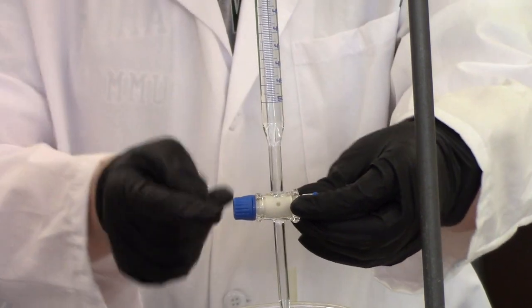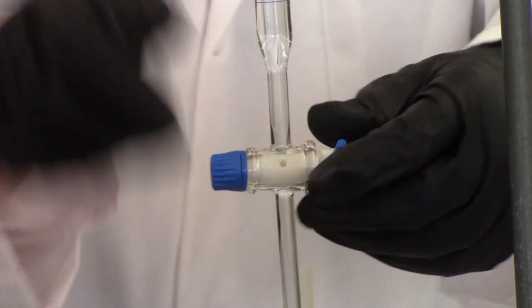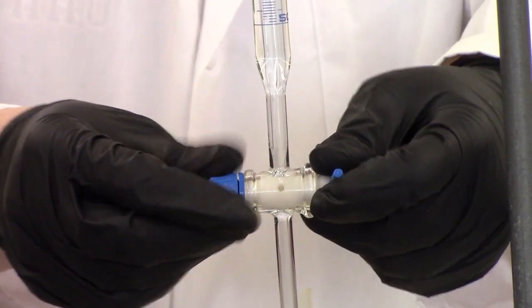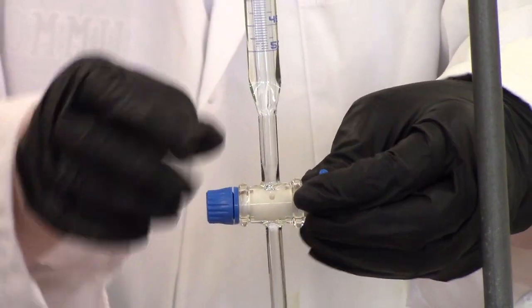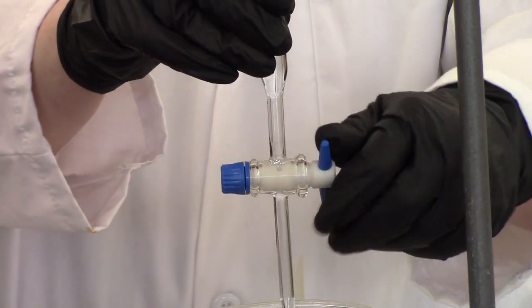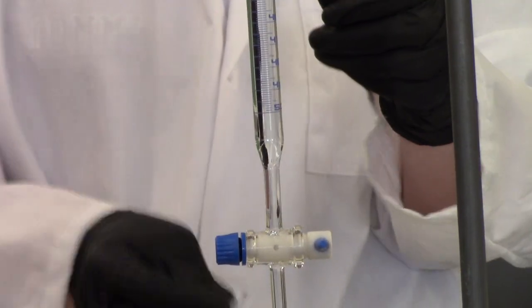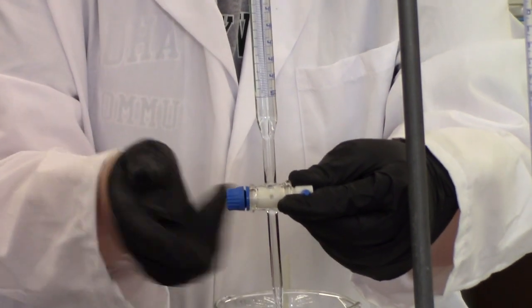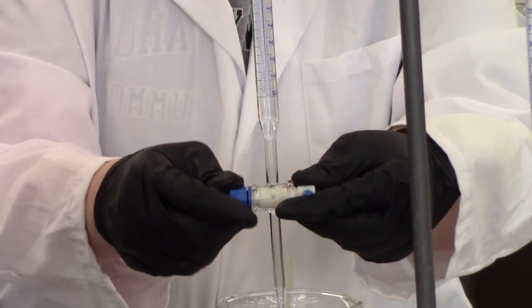All right. If you still have really stubborn bubbles and adjusting the valve doesn't work, you can also do a couple tricks. Maybe that was a little snug, so I'm going to loosen it. You can get the valve so it's almost vertical and then really quickly turn it. That wasn't really quick. Really quickly turn it to let a tiny bit out, and that can kind of force the bubble to go. Or you can open it wide and tap it. Okay. It can take some finesse.